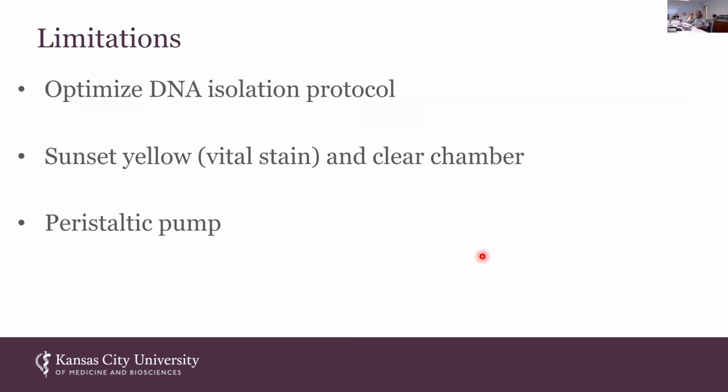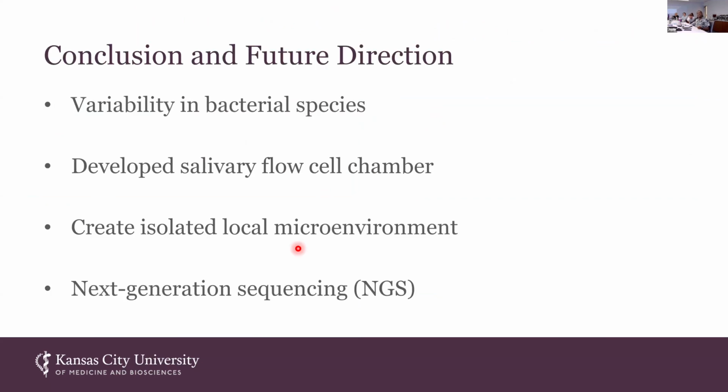We also plan on using a peristaltic pump as opposed to the one we used in this study. The peristaltic pump is going to help us run the saliva and the KHB buffer at a slower rate for days, as opposed to just the 12 to 24 hours that we ran this for, so we can better visualize our biofilms. And here are just some conclusions.